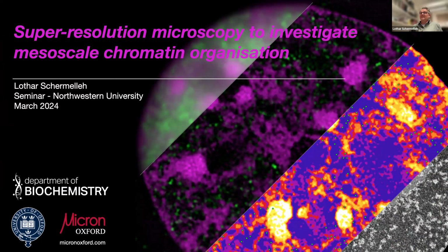So, yes, our research interest is really studying the organization of the nucleus and chromatin, and we do this by advanced imaging methods. If you look at this image here, of course, it's about pushing the resolution, the quality of our data from something like here in the corner to get a much clearer, more detailed picture.